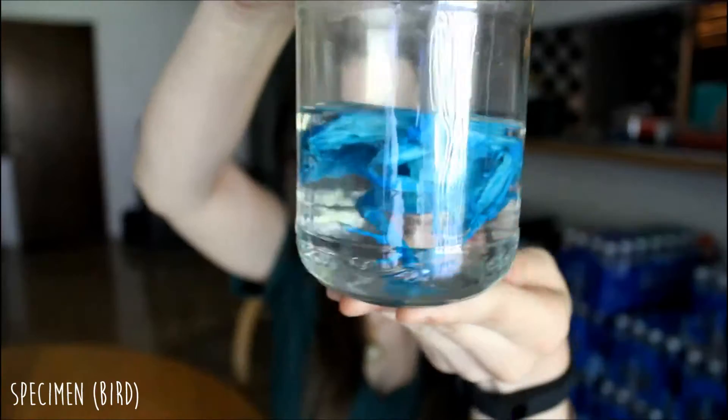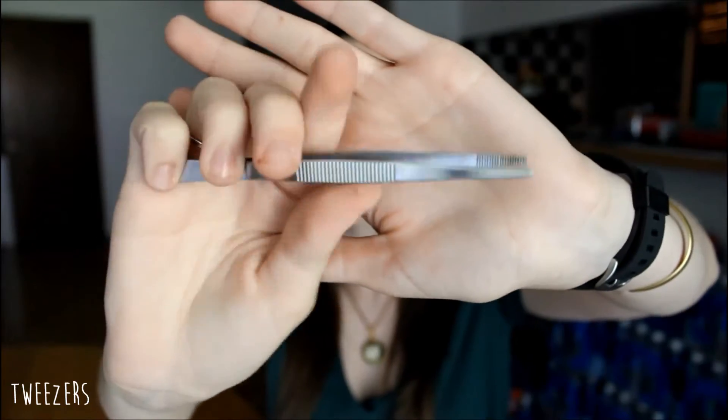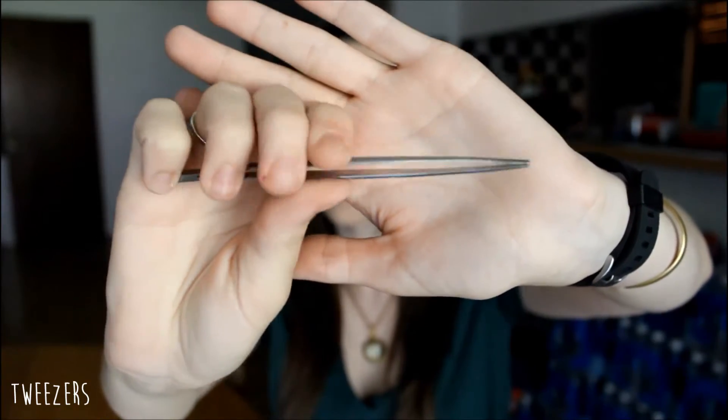In this video, I'm going to be taking the bird through the trypsin digestion. Here are some of the things that you're going to need: my specimen — the bird — an empty jar, a scale, tweezers, and lab gloves.